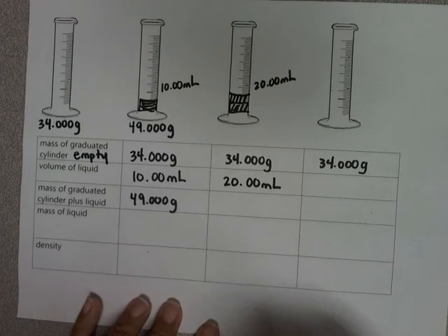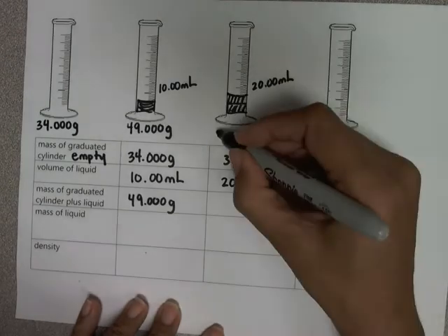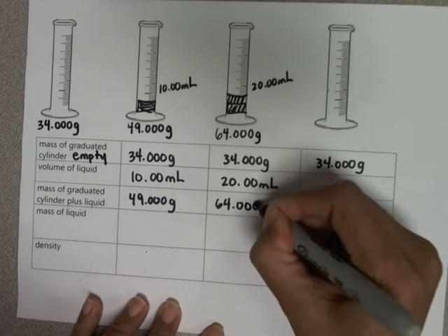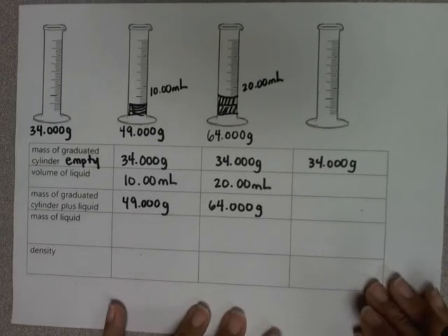And I find that mass, the mass of 20 milliliters of liquid plus the graduated cylinder. All right, and let's say that that is 64 grams. So the mass of 20 milliliters of liquid and the graduated cylinder is 64 grams.